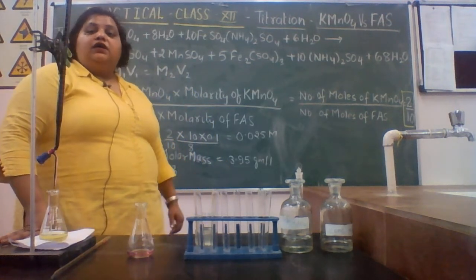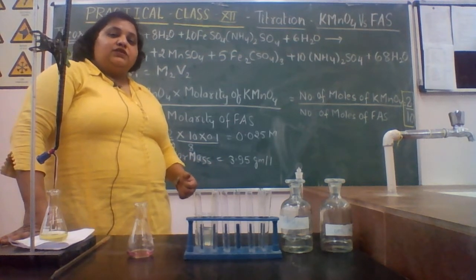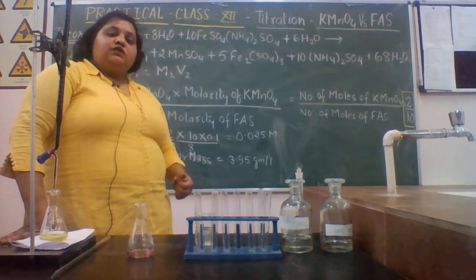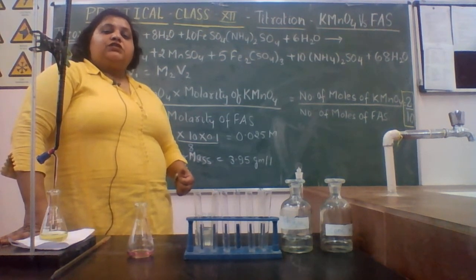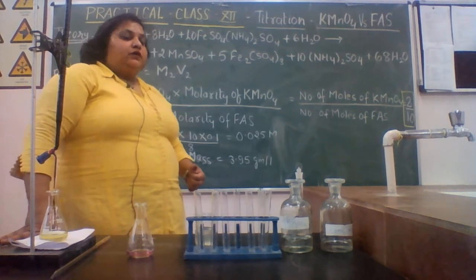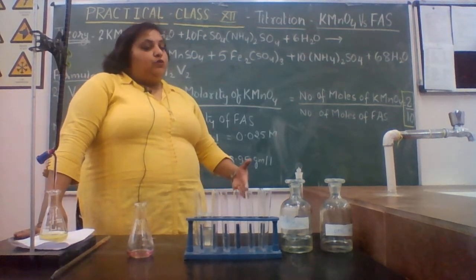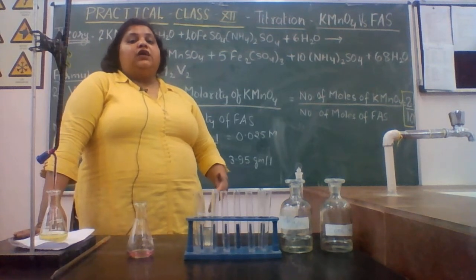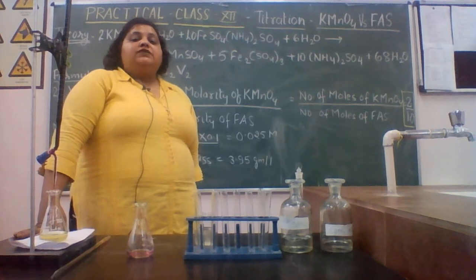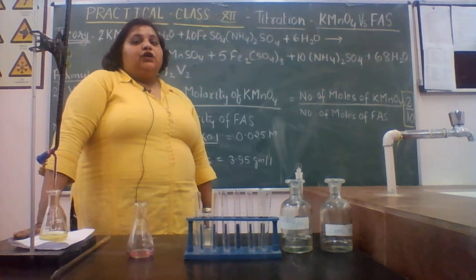The accuracy is the main purpose of teaching you this experiment in the video lesson, and I hope you must have learned the procedure, the method of calculation and the precautions of this experiment. I hope this video is useful to learn one core experiment that is going to score 8 marks in your practical exam, as well as for the sake of the theory exam you have to learn this topic.